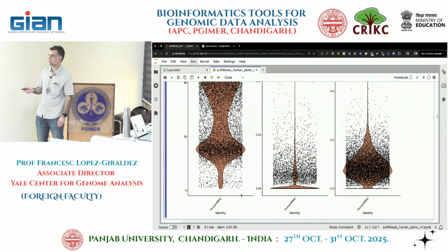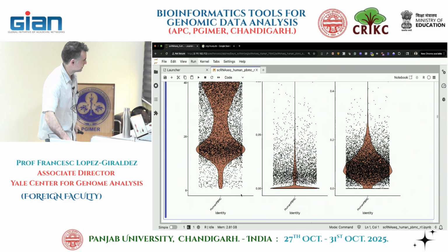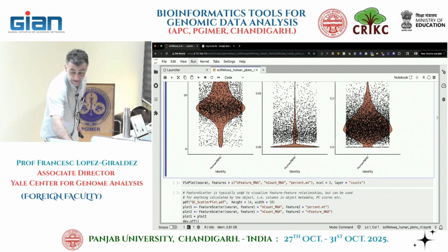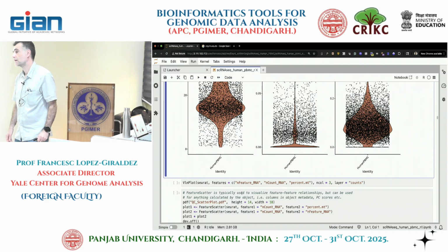These were two different genes, right? In those cases, it's normal that you see very low expression, because we're just taking one gene. What is this on the y-axis? It's the percentage. So in RNA sequencing, we do not do rRNA depletion? Yeah, you do, in the library preparation. They use poly-A selection, and they can use other systems too, but Bonnie knows all the library preparation techniques.